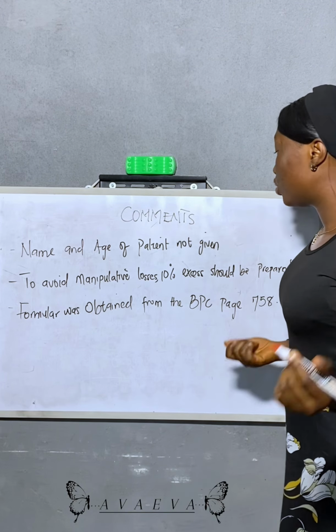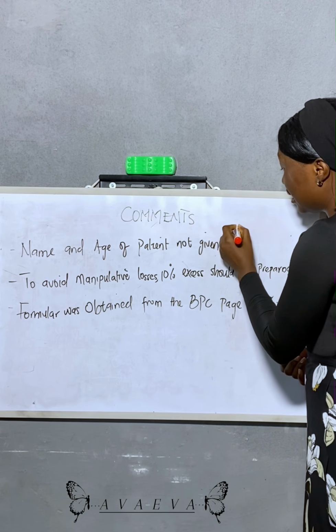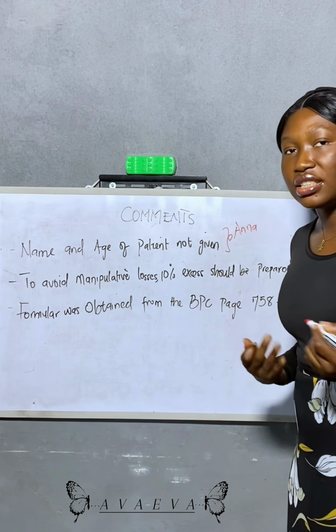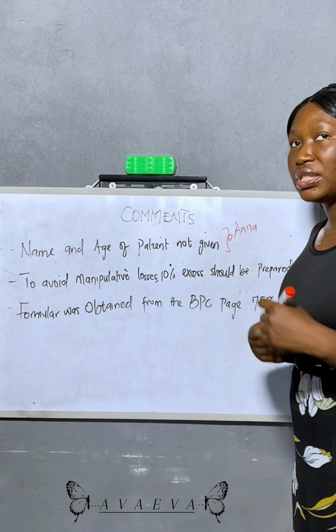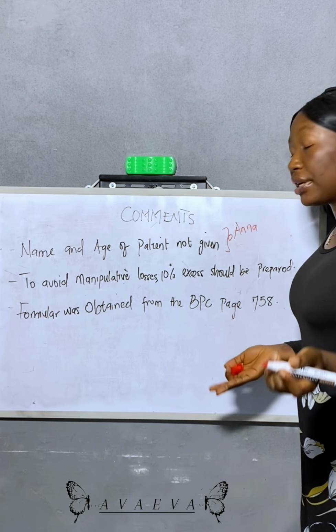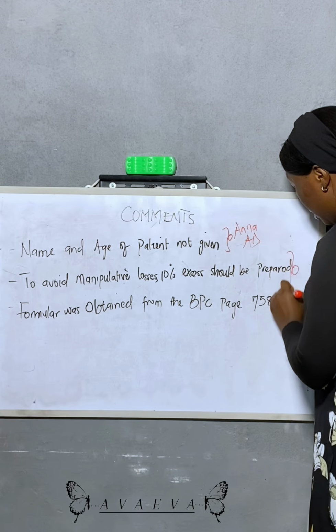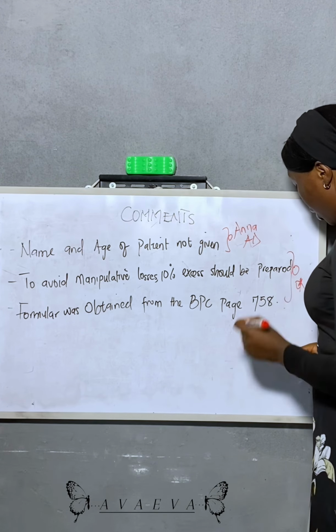Now the lecturer could just go ahead and say this is Anna, and Anna is a child or adult. It doesn't really matter with external preparations like ointments and creams, but let's say Anna is an adult, and for this you could just have it as okay.